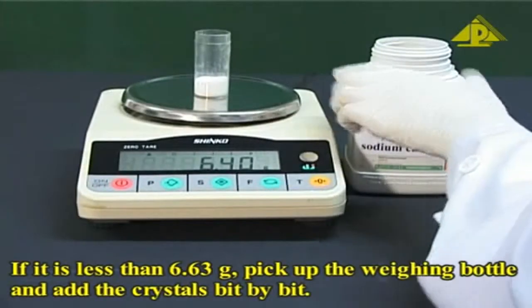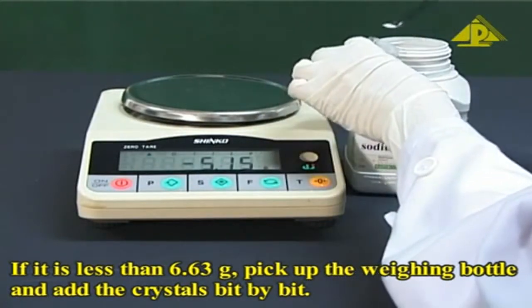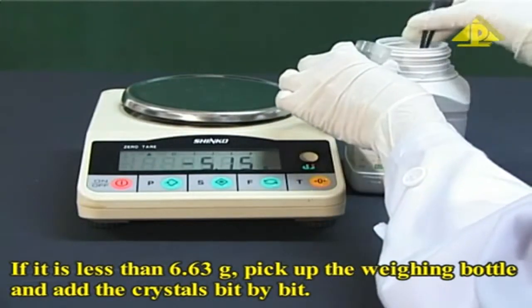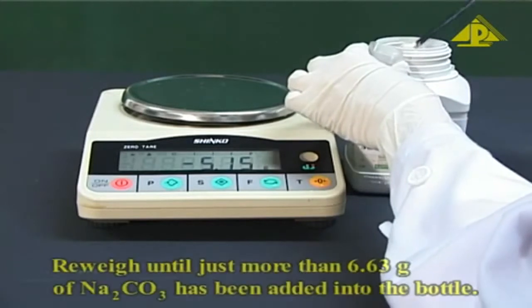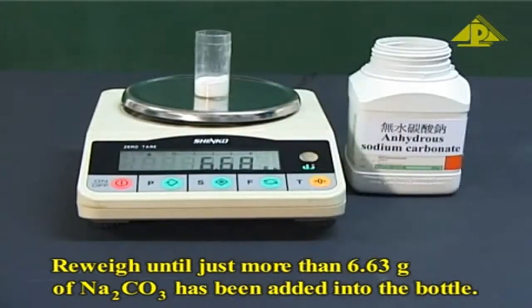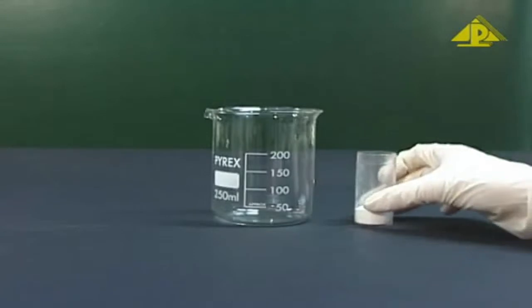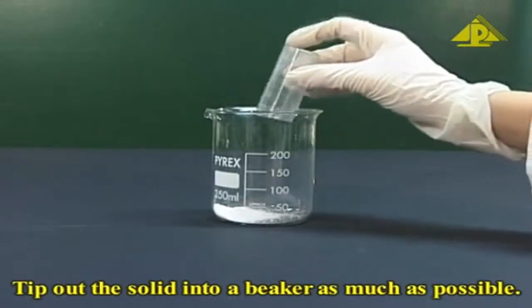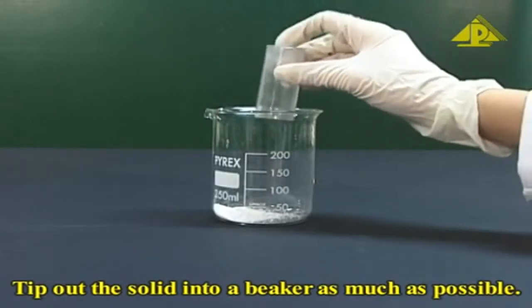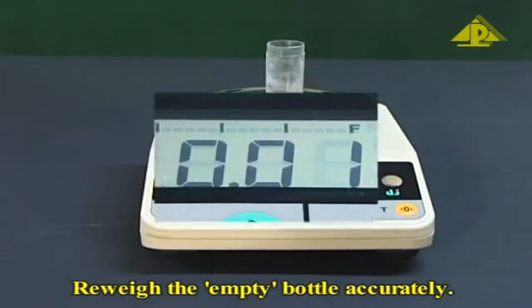If it is less than 6.63 grams, pick up the weighing bottle and add the crystals bit by bit. Reweigh until just more than 6.63 grams of sodium carbonate has been added into the bottle. Tip out the solid into a beaker as much as possible. Reweigh the empty bottle accurately.